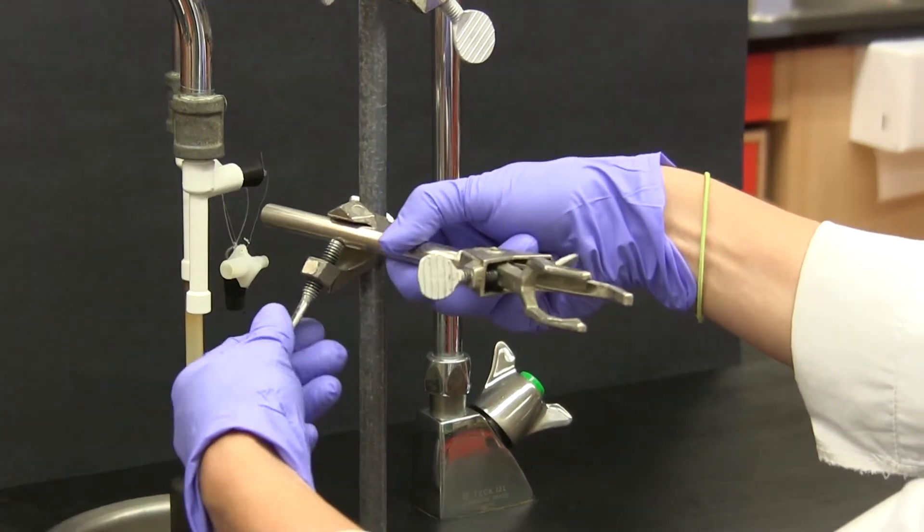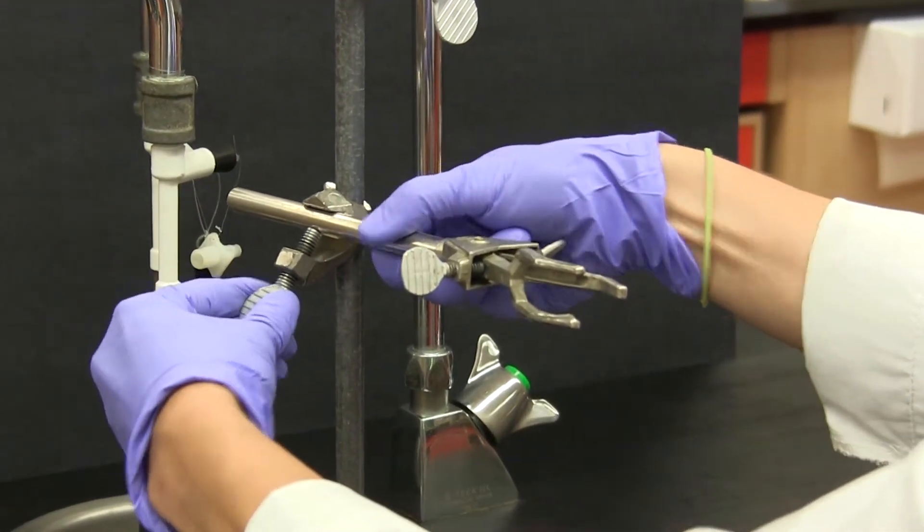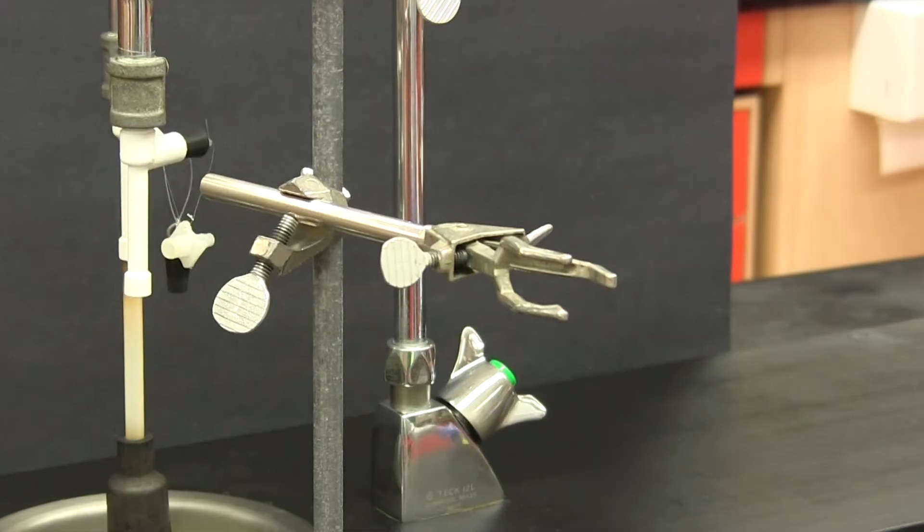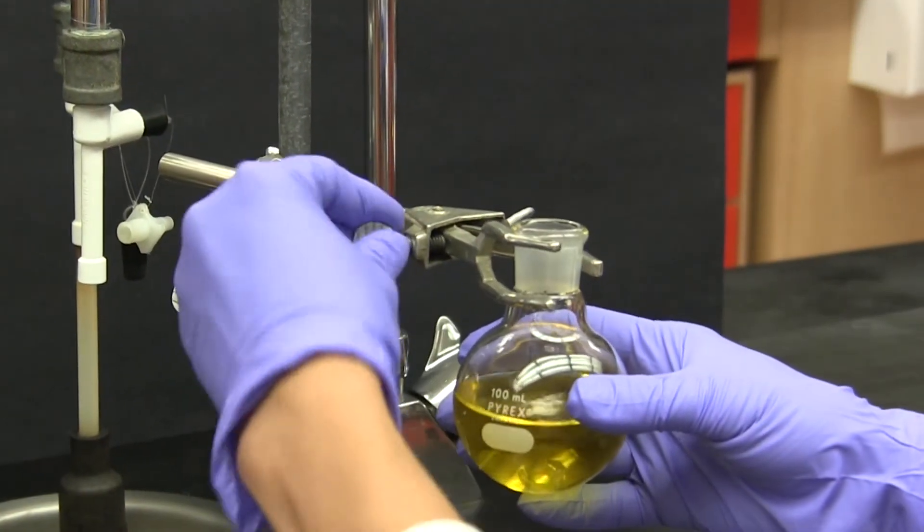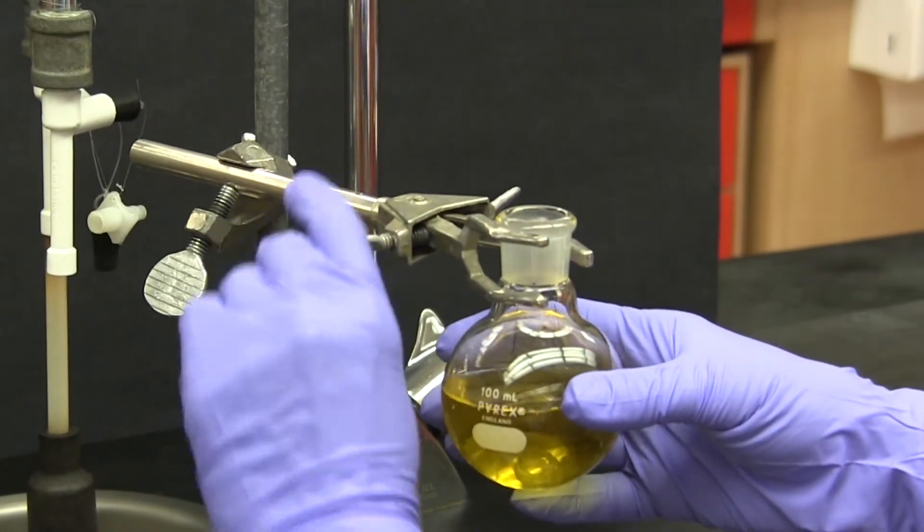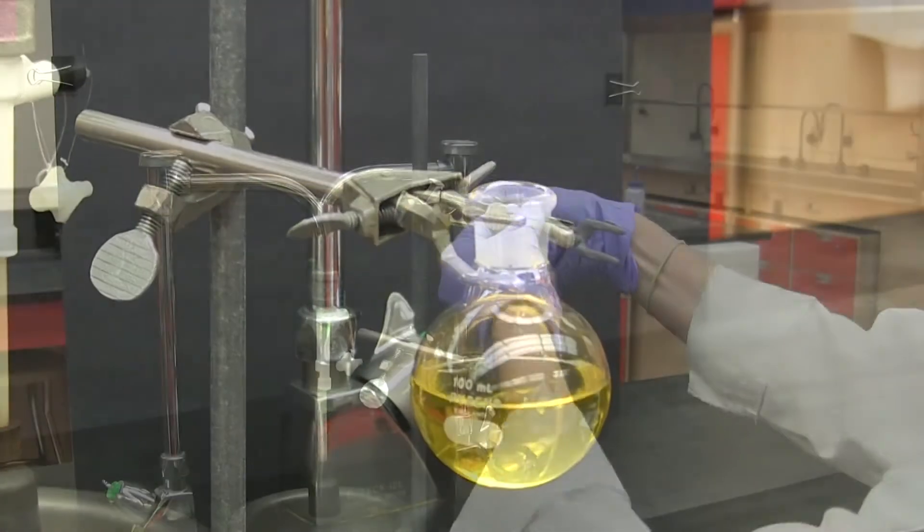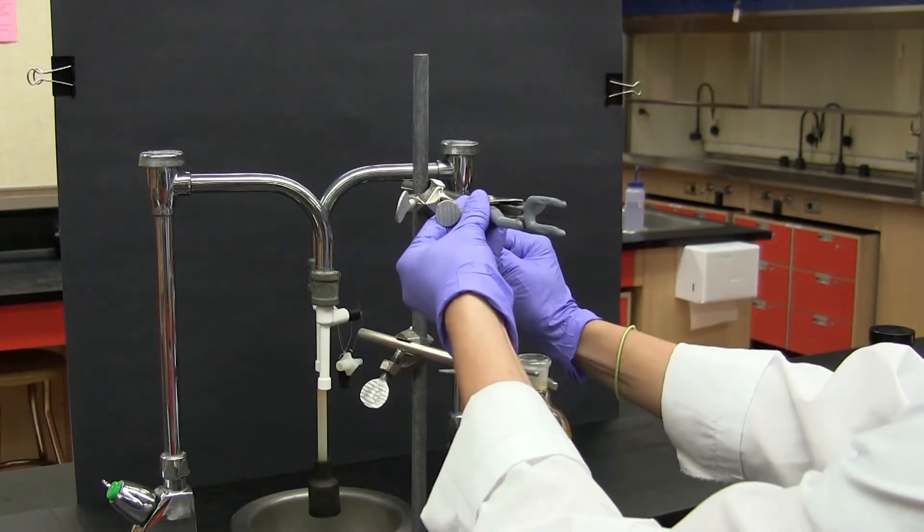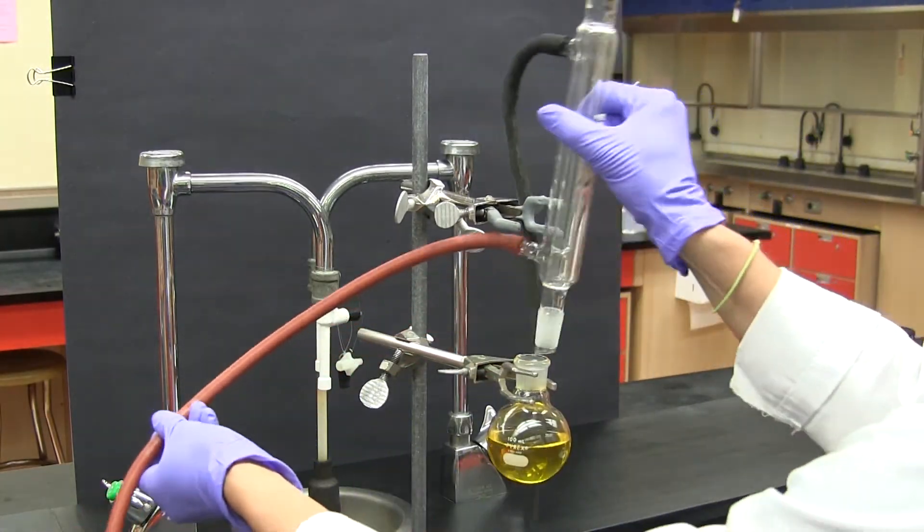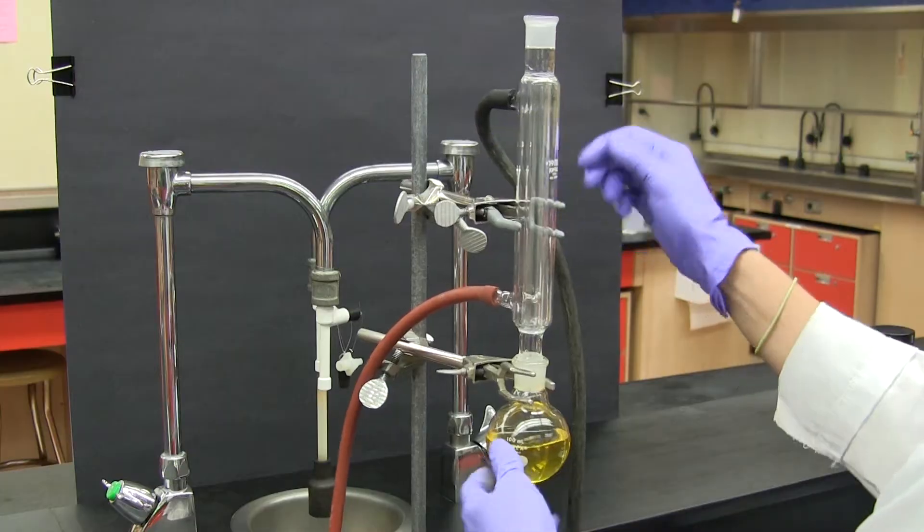Assembly of the reflux apparatus begins by securely clamping the reaction flask. If this is first clamped securely and vertically the rest of the apparatus will be easier to fit together properly. A condenser is attached to the reaction flask making sure of a good fit. It also is clamped in position.